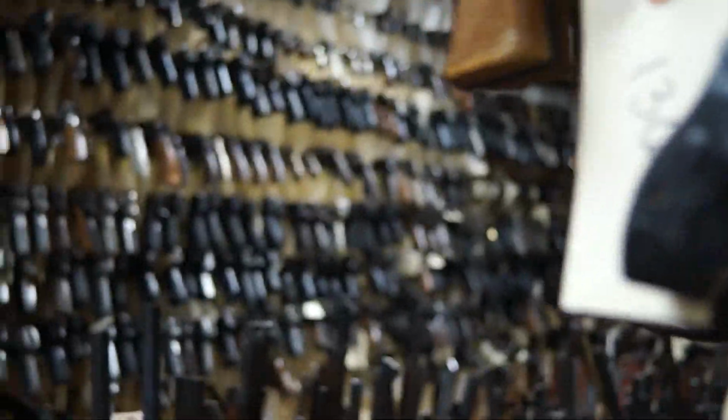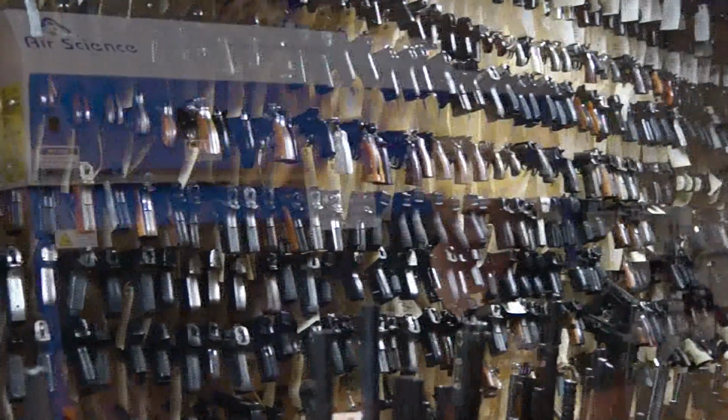Firearms and tool marks. A photo lab, so we process our own photos here. And the forensic garage. Any of the vehicles involved in crimes that get sent out to the forensic garage, and we have a technician out there that processes them. And MAFIN section, which is our automated fingerprint identification network.